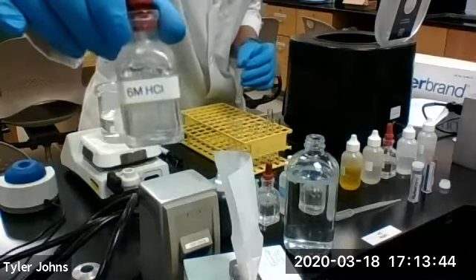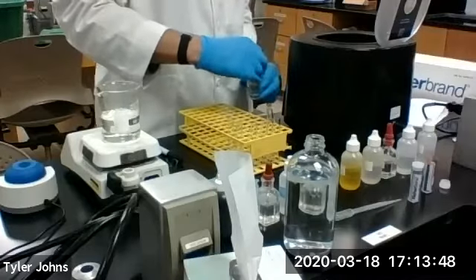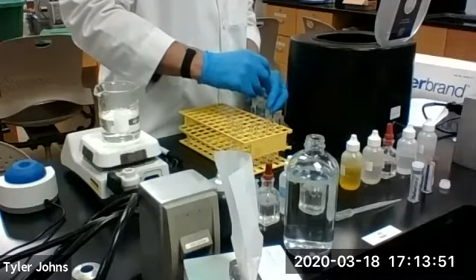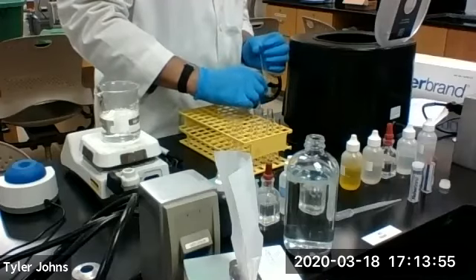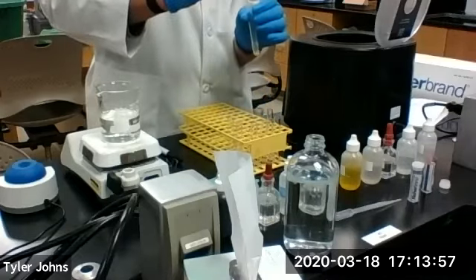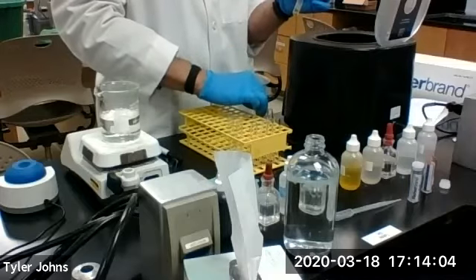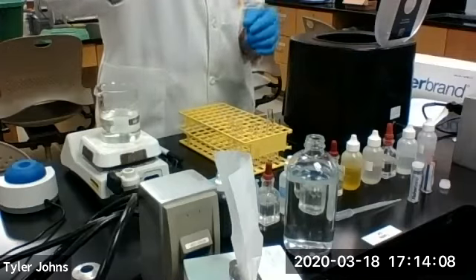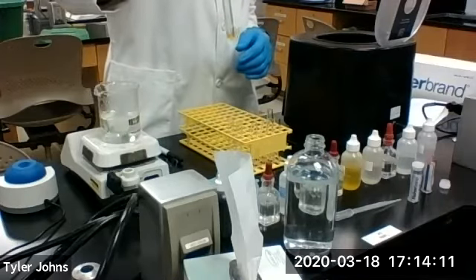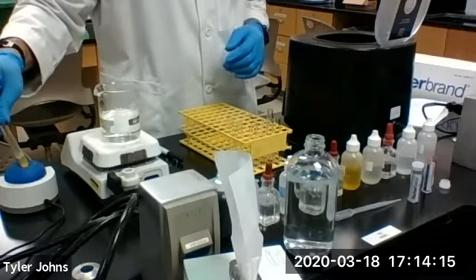Here's our 6 molar HCl. We've added our 6 molar HCl. We're attempting to dissolve the barium chromate.